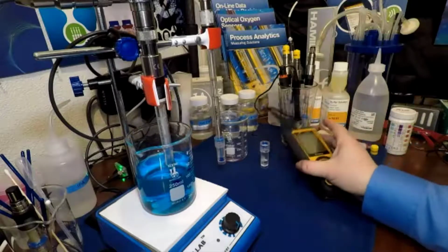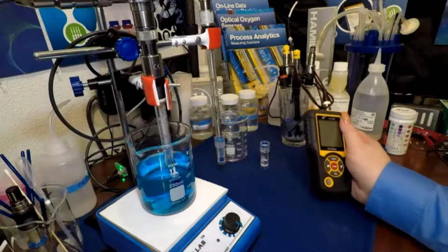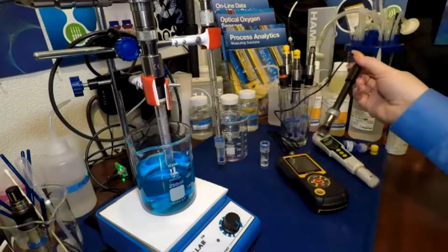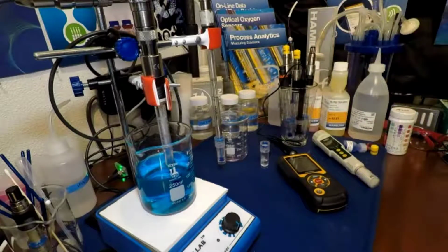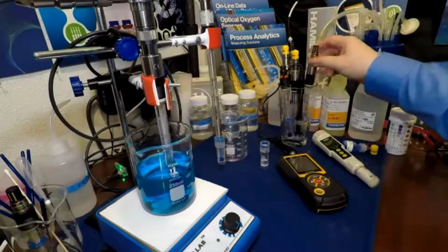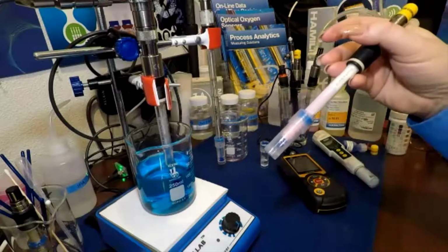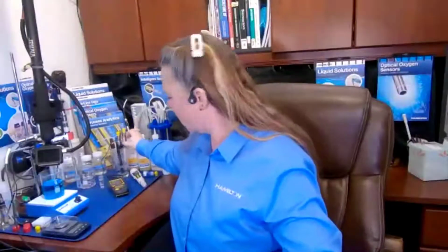Then you get laboratory sensors. This is actually a higher end hot tub and water sensor. I use it in some of my hydroponics. It is closer to a laboratory sensor. This one has a plastic body, but you have really good laboratory sensors in your facility. Then we have the glass ones that have different connectors. And then you can even have glass ones that have solid polymeric. And we're going to go through all of these. But these are some of the sensors that are available within pH measurements.